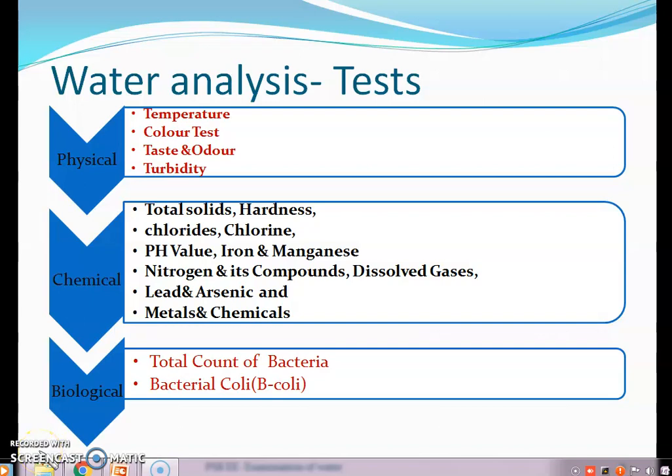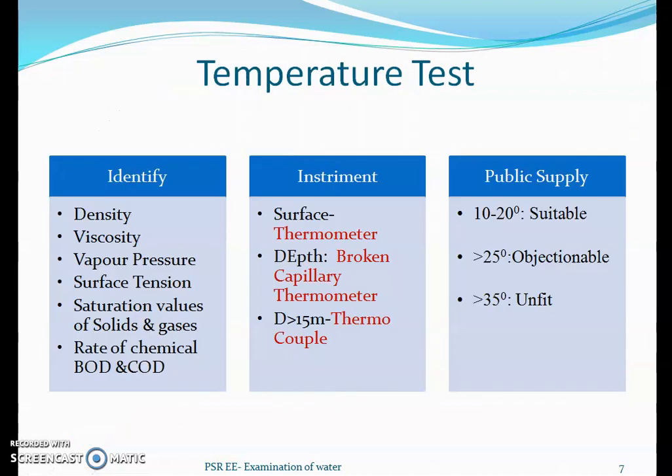Hello dear students, in the last video we discussed the importance of the examination of water, or water analysis. In this video we are going to discuss a few tests on water, and we are going to see only the physical tests, that too temperature, color, and taste and odor tests. In this video let us see what the temperature test is and how it can be carried out on water.